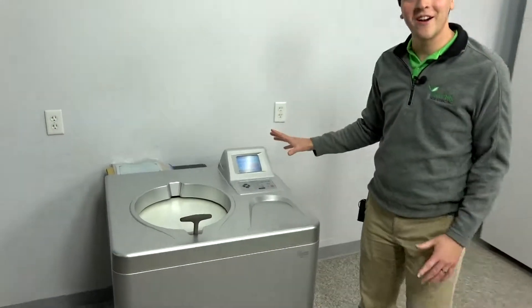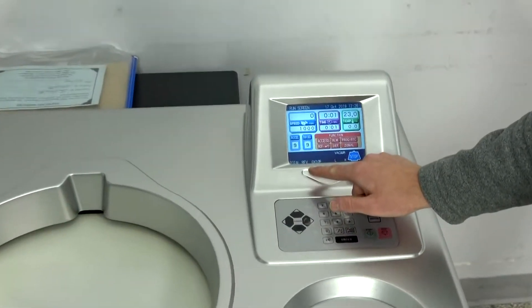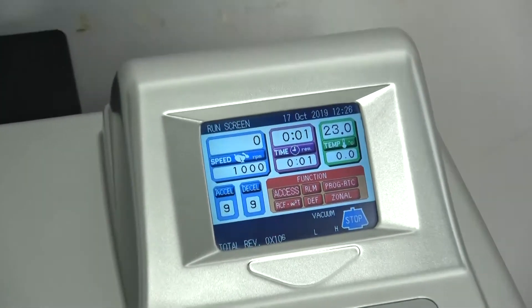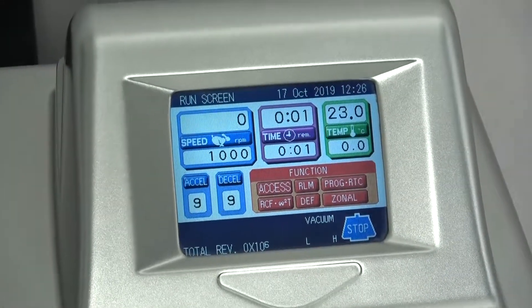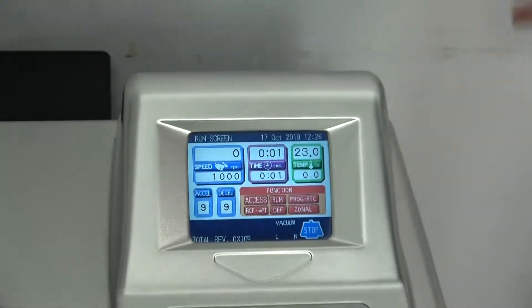If you zoom into the screen, or look in our description, you'll see that it actually has zero revolutions. This is technically a very slight white lie — it does have a few, but it's basically zero when you consider how many times you're going to spin this thing.